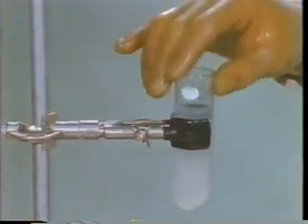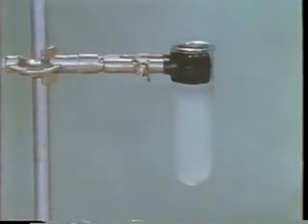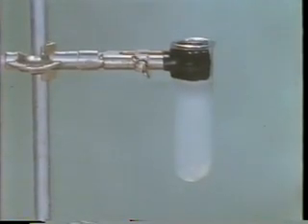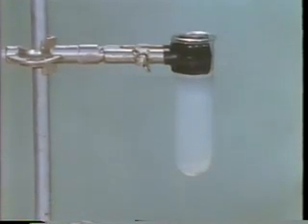After the centrifuging, the liquid fraction contains the soluble DNA. The pellet contains the undissolved residue. According to our theory, if the 5-fluorouracil is incorporated into the DNA molecule, radioactivity should be detected in the liquid. Otherwise, it should be found in the pellet.